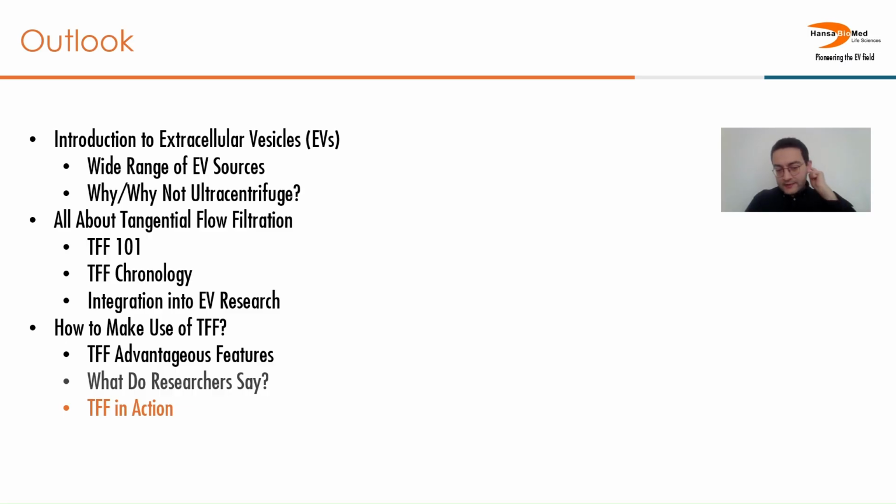And finally, now let's move on to some case scenario examples, meaning how researchers use TFF in their studies. For this purpose, I will present you with 5 different examples, each focusing on different aspects using different source EVs.